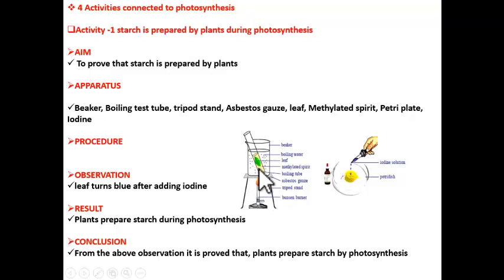As the water boils, it heats methylated spirit and this hot methylated spirit removes green color from the leaf and leaf turns pale yellow. So now remove that leaf, put it in petri dish. Now perform iodine test. Add a few drops of iodine over the leaf and observe the color change.